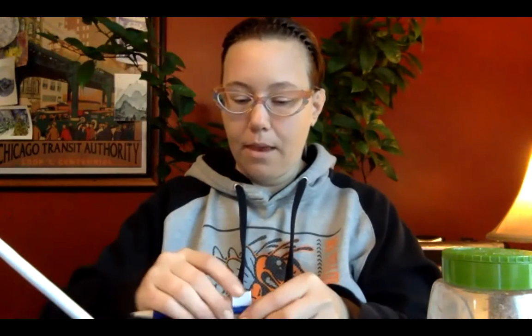And this one will be much more dramatic than the plant thing. So paper chromatography is specifically for doing this with pigments. Again, like anything. I also messed around with food coloring because your non-primary colors have the hidden pigments, right? So I used green food coloring, but guess what pigments it pulled out? Blue and yellow. Yes. Oh yeah. I'll show you.